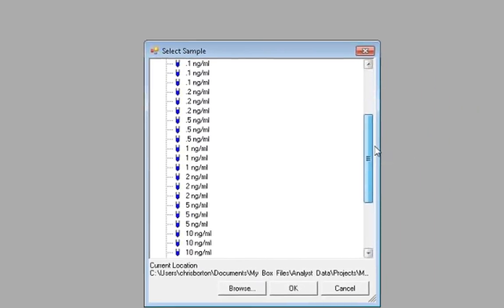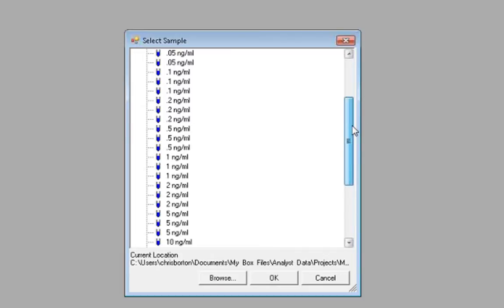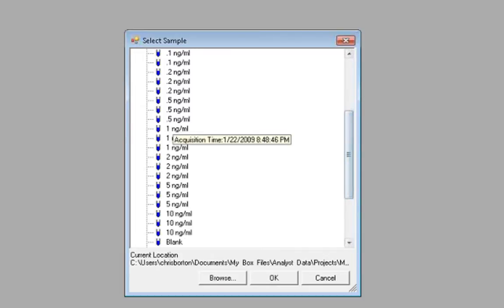You will first need to select a representative data file to use to create the method. This will typically be one of the mid-range calibration standards for your batch. Here we will select our 1 nanogram per milliliter standard.